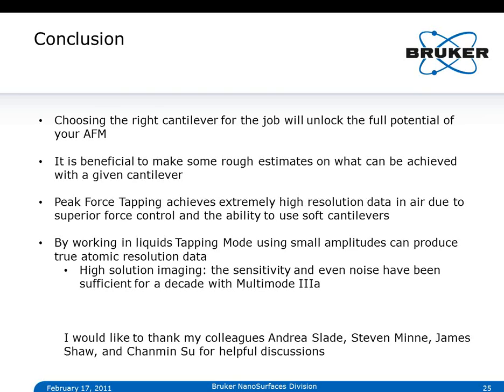When you look at the imaging as we perform it when we do peak force tapping, and you look at some real-time force curves, you will see some ringing. That's unavoidable. However, and that's where the trick comes into play, you have to make your software that analyzes the motion and the behavior of the cantilever smart enough to ignore that ringing.